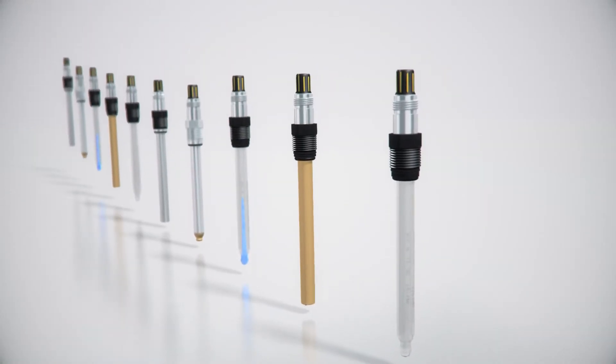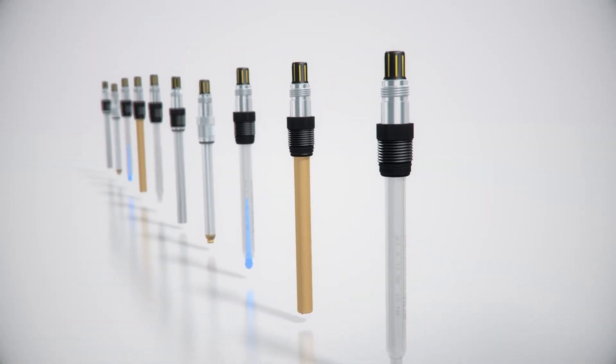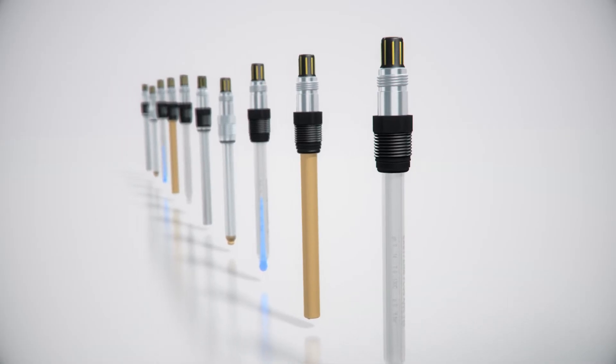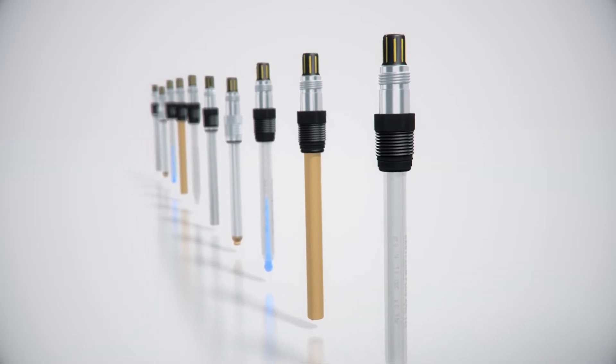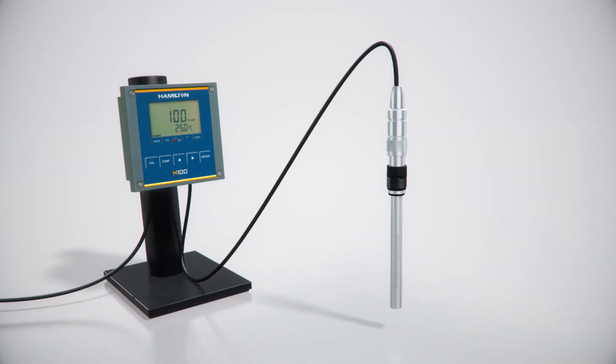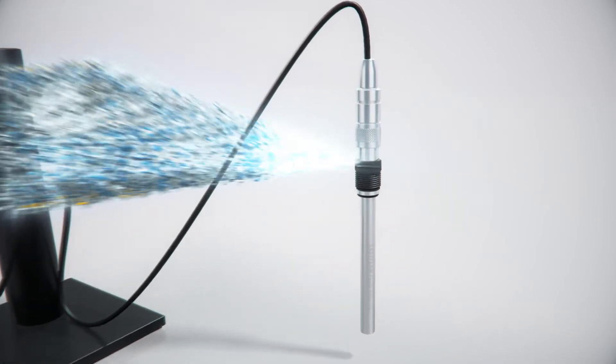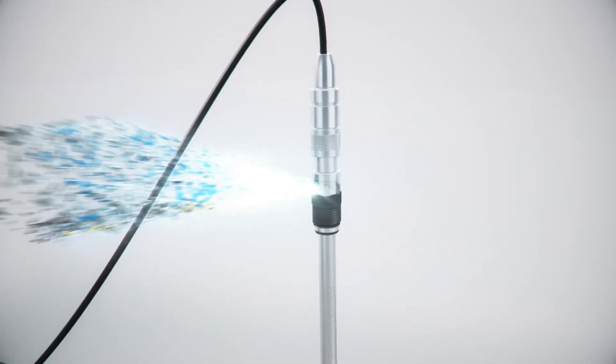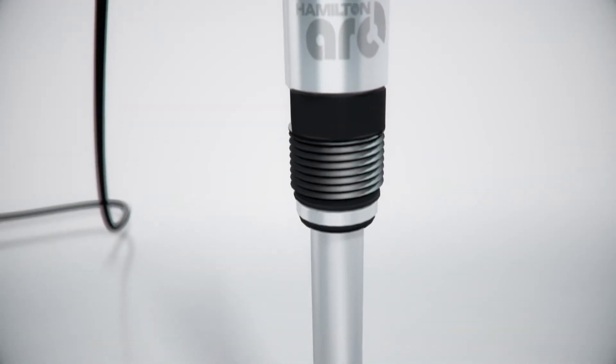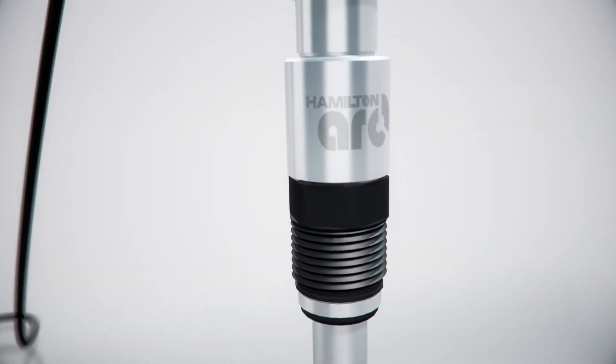Hamilton sensors have always combined advanced features with easy-to-use technology. With ARC technology, we integrated the transmitter into the sensor, allowing calibration in-lab, on your time, setting a new industry standard.